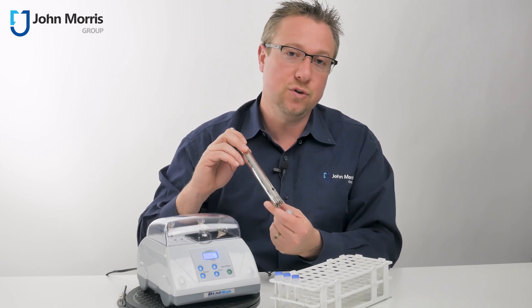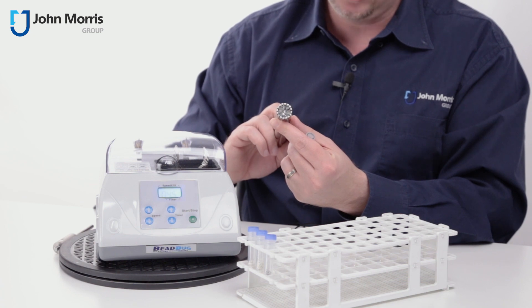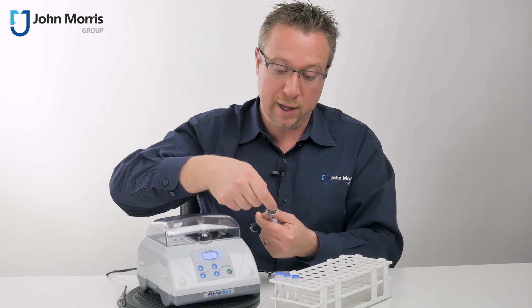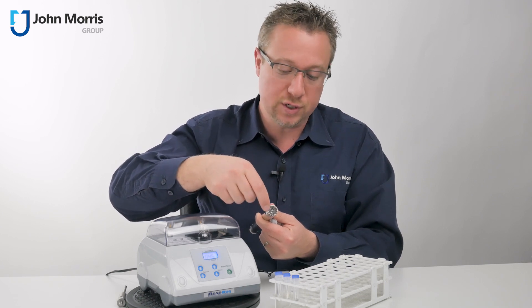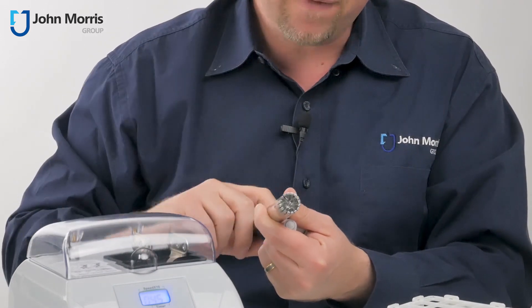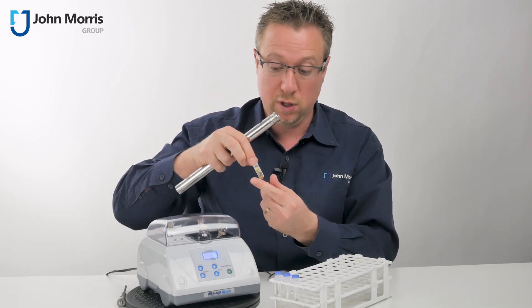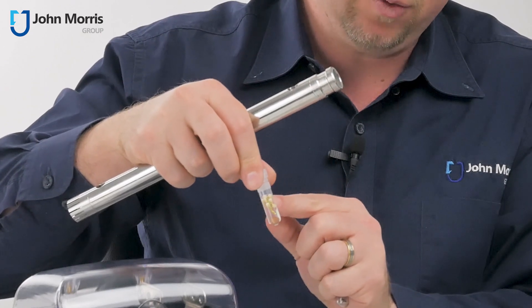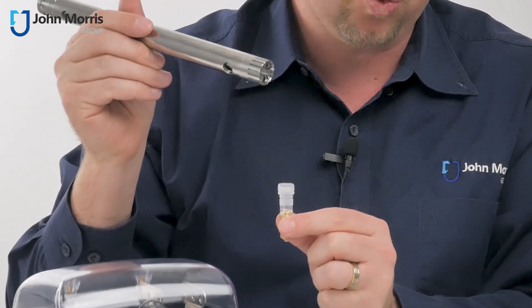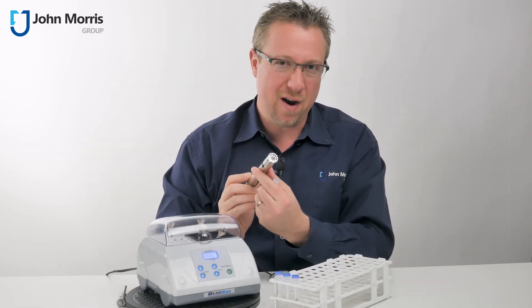Another approach is to use something like a traditional Ultratarix or high shear homogenizer. What happens here is you have one non-moving blade and a rotating internal blade that rotates at high velocity — thousands of times per minute — and it's like having scissors that cut. These are very effective for fibrous materials as long as they're in suspension. Here for instance you can see this part of a tree with its leaves is in suspension, and a smaller version of this would work really, really effectively.